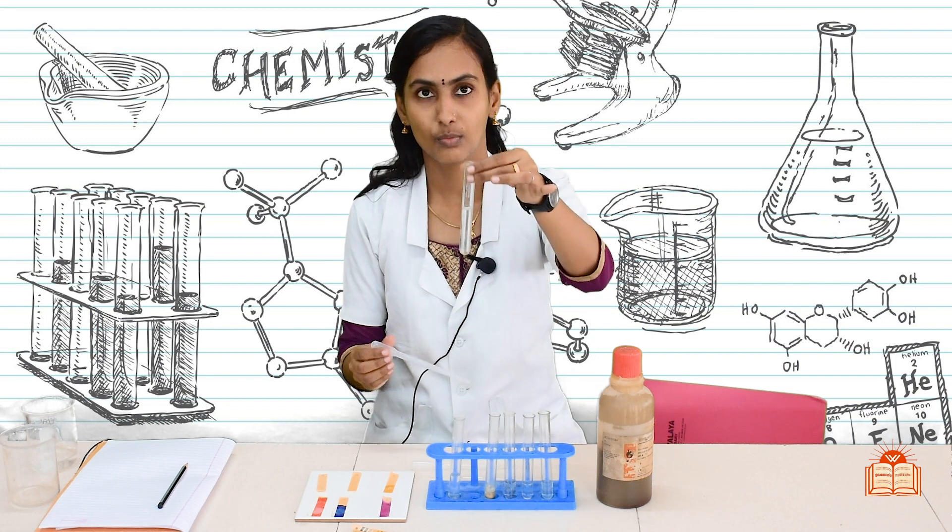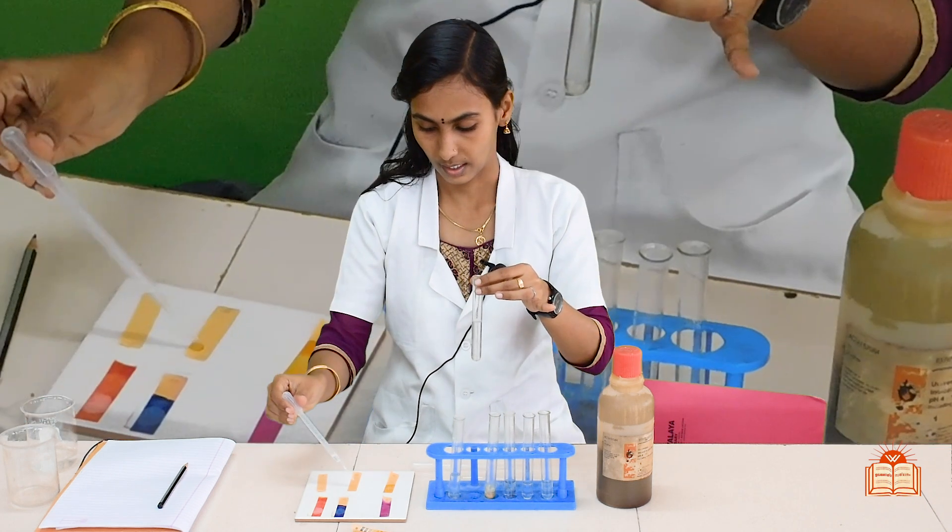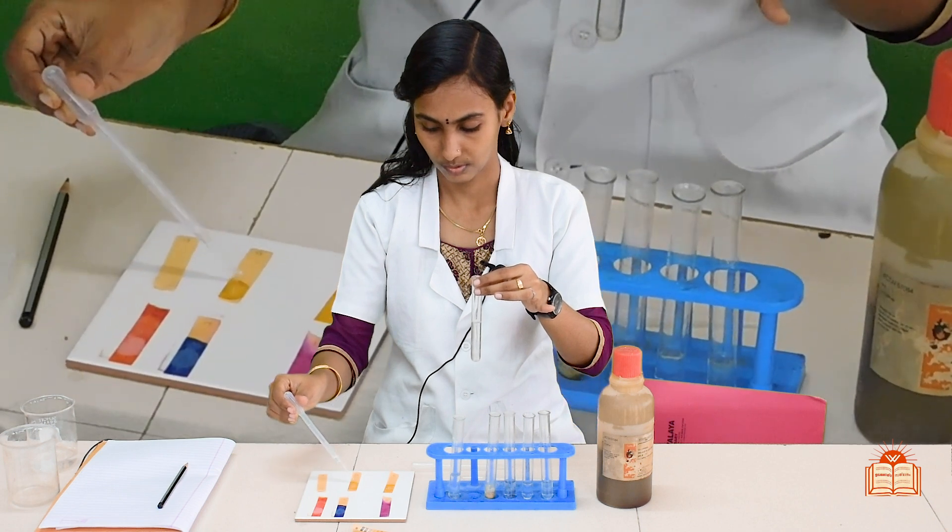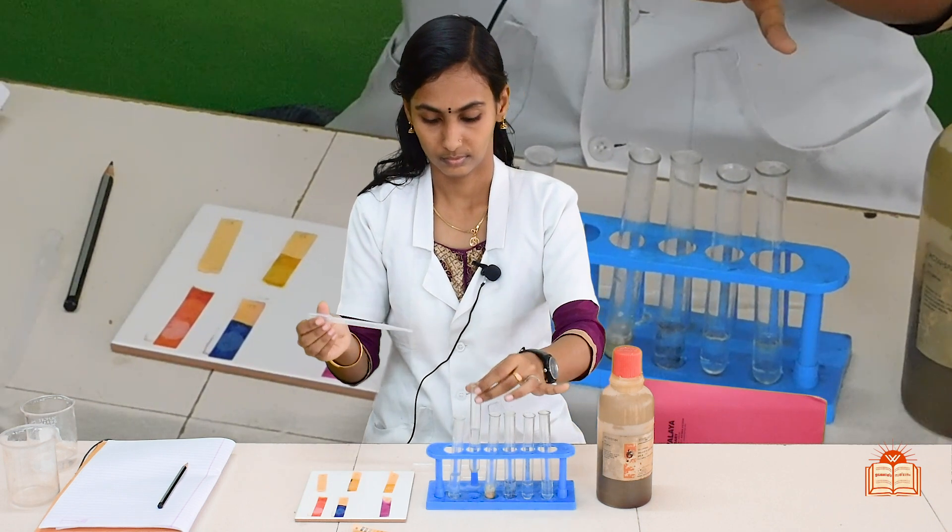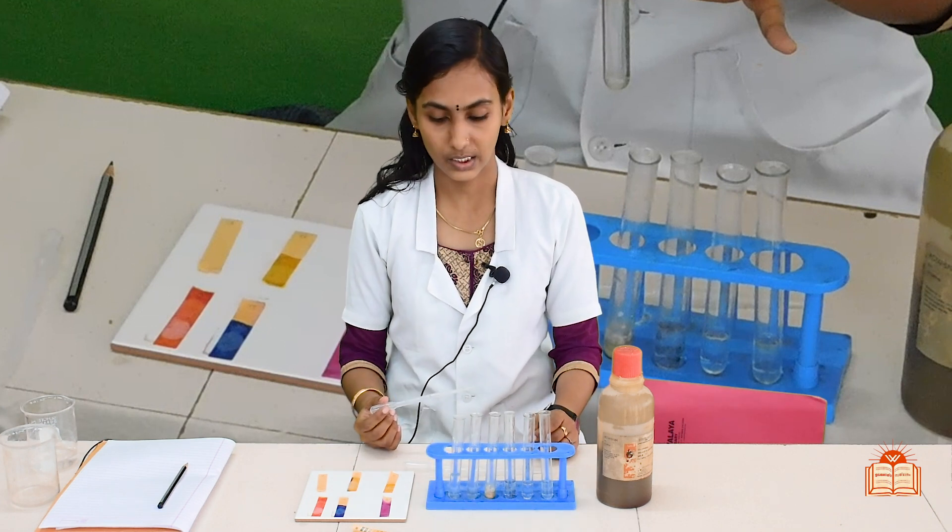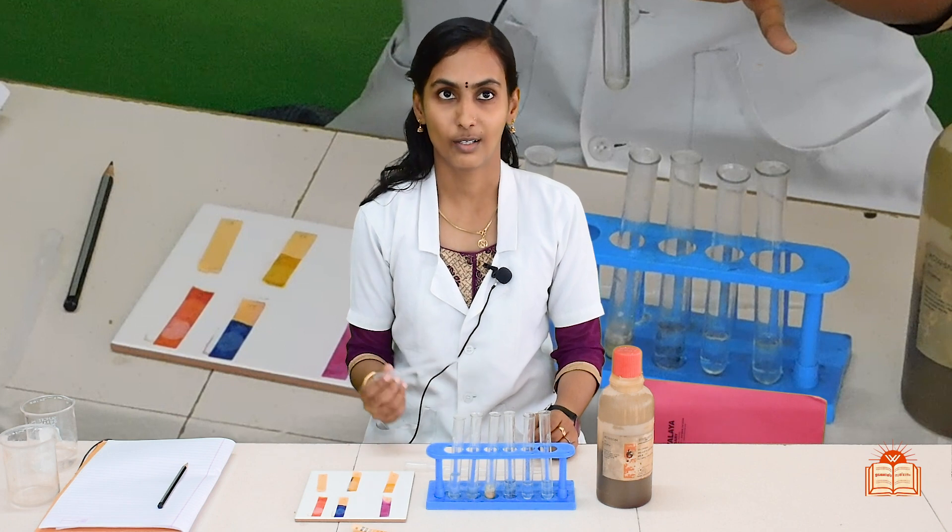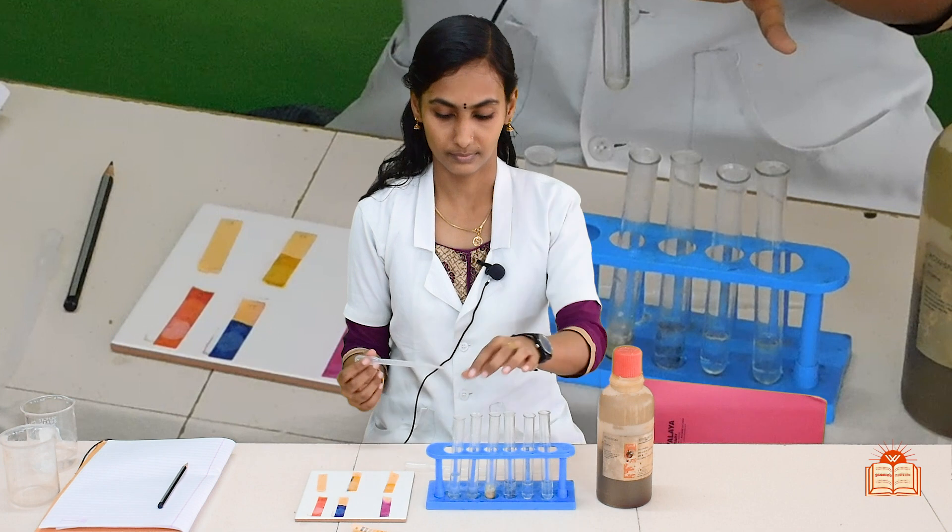Next one is water, so take some drops of water and add that to the strip. You have to take care, the dropper should be cleaned properly, otherwise you will get the color of the previous solution. It is actually pale green color.